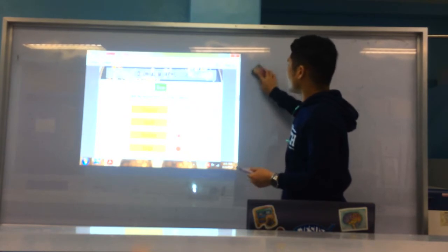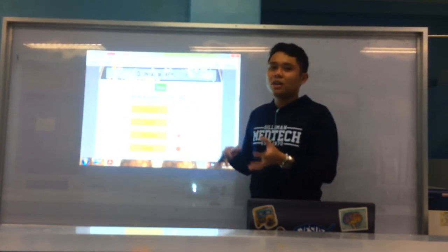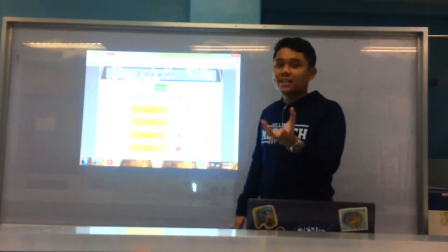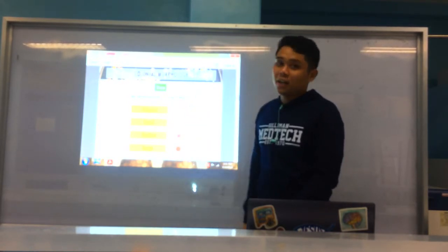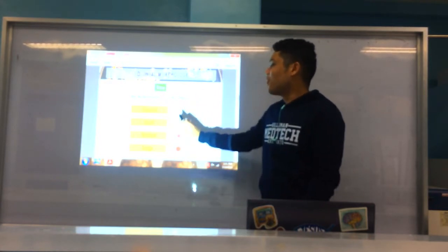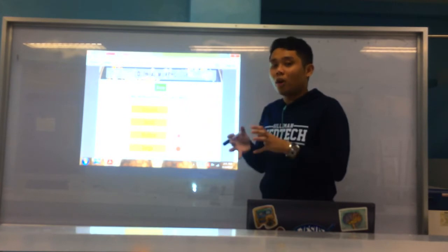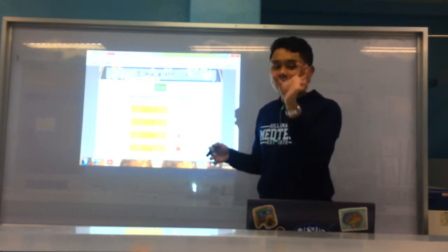Usually, large colonies are gram-negative bacilli, their colonies are usually big. Generally, this is how we describe colonies in terms of size: pinpoint, small, medium, large. There's no extra large, guys. Again, you can measure it in millimeters or estimate it, based on how you see the colonies subjectively.